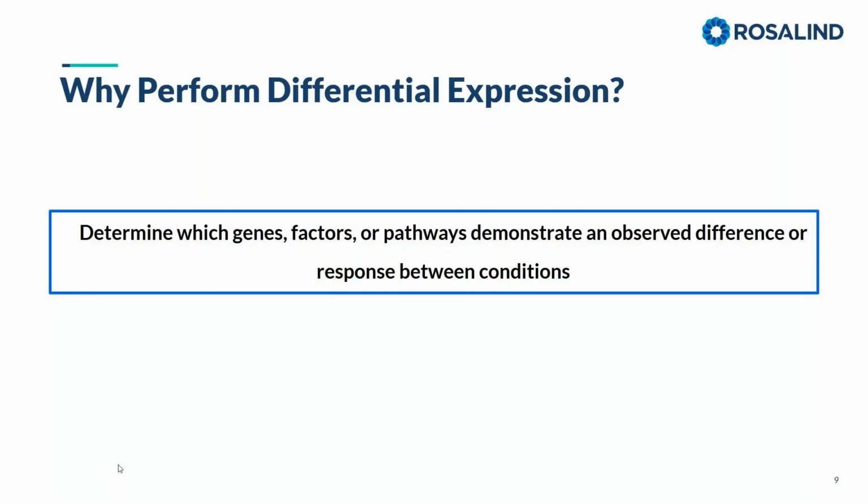So in a very vague, generic description, why is it important to perform differential expression? Differential expression helps us determine what genes or proteins or factors or pathways can demonstrate an observed difference or response between conditions or a model.